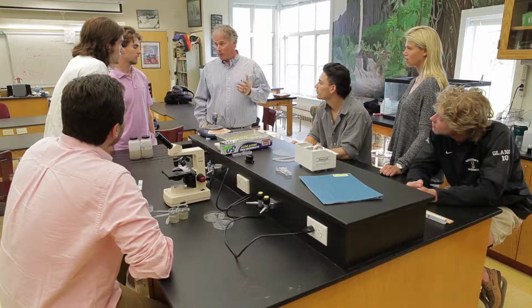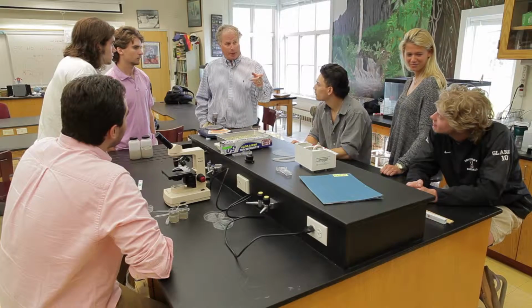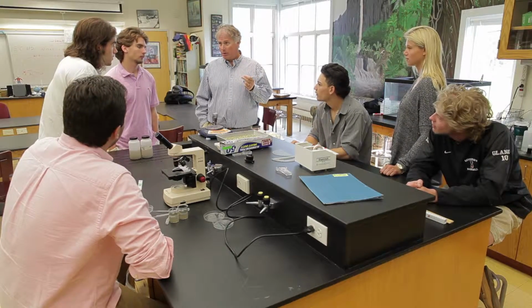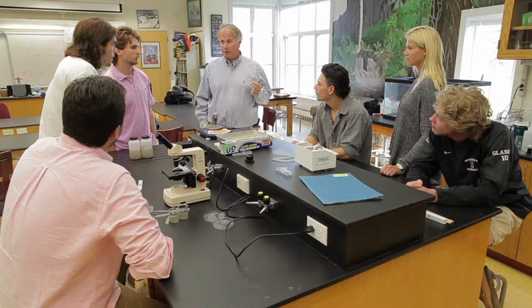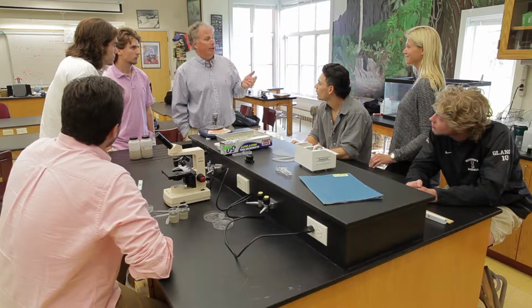Sunlight. Right, sunlight. So there are two kinds of plankton. What are the two kinds? Phytoplankton, which get their energy from the sun, and the other, zooplankton. Where do they get their energy from? They're eating the phytoplankton, the plant types. So you're going to see lots of phytoplankton. The common one is called a volvox. It looks like a ball with little tiny spikes sticking out of it, and it actually rolls around inside your sample. That's a common phytoplankton. The copepods are a zooplankton, going around eating other plankton.